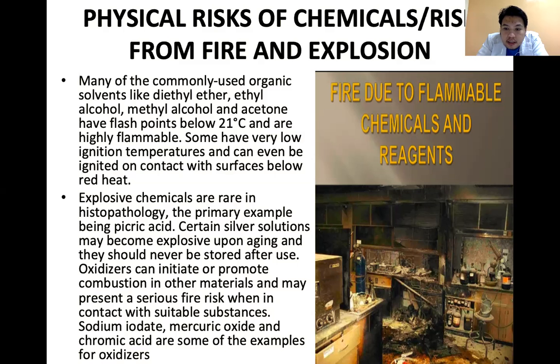Equipment na are not being checked. So explosive chemicals are rare in the histopath, the primary example being picric acid. So certain silver solutions may become explosive upon aging and they should never be stored after use.